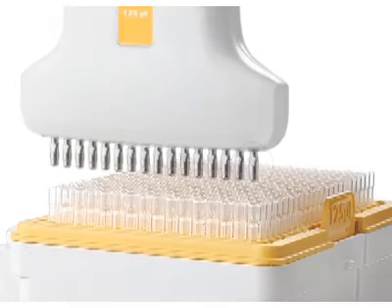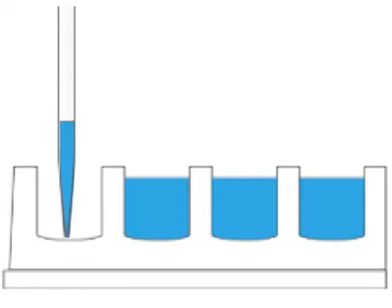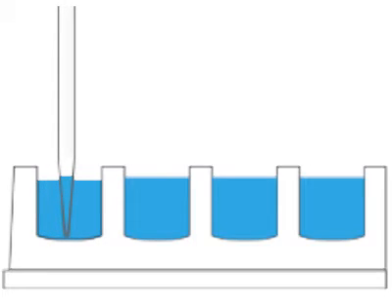Integra's patented tri-lobe tip fitting ensures that tips snap into place, gripping the pipette to deliver the highest lateral resistance on the market. Even when aggressively and repeatedly touched off across an entire plate, tips will not loosen, leak, or fall off, ever.